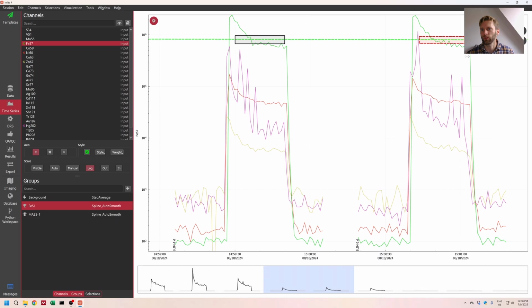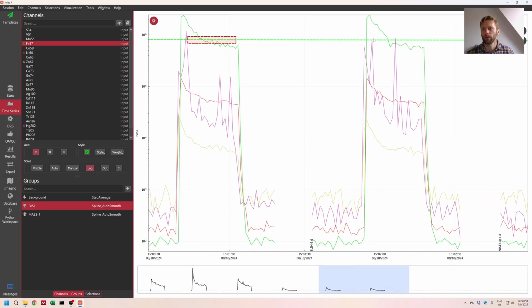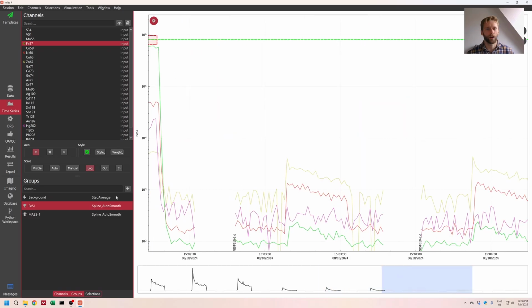But for samples, having a funny looking peak might actually mean that you're not just analyzing, you know, a sulfide or a clinopyroxene or a magnetite or something that you intended to analyze. It may mean that as you're measuring, you burn through the magnetite, or whatever you're measuring, and you begin analyzing something else.